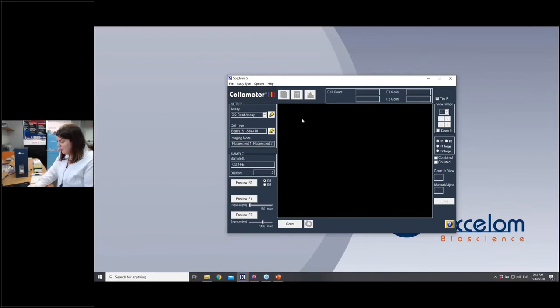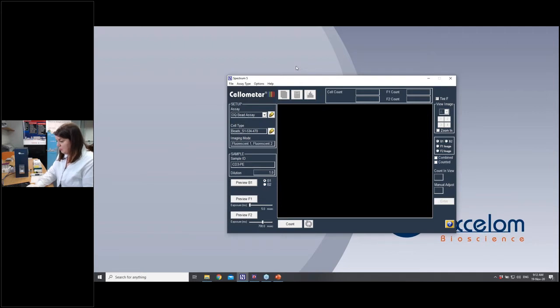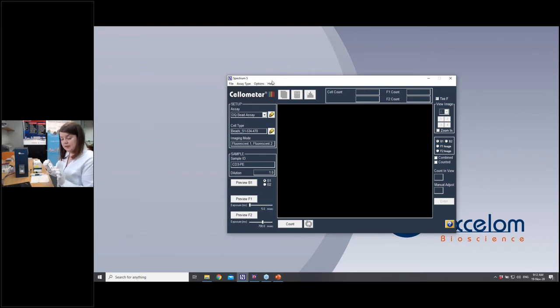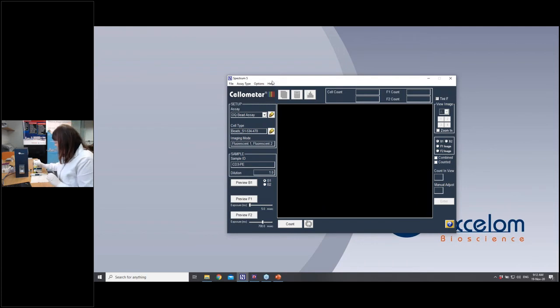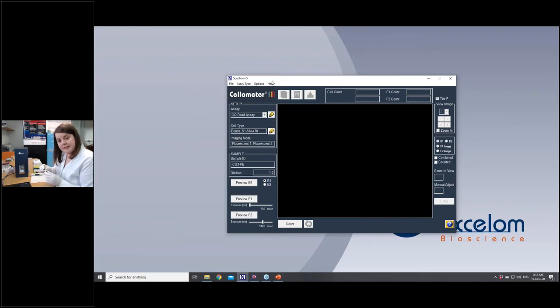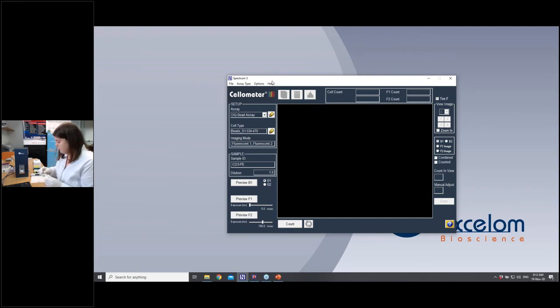Okay, so I hope you can now see my Spectrum software up here. I apologize if it's a little bit small. Hopefully you can see it well. I'll try and zoom in on some of the images so you can see those a bit more clearly. So this is the software and this is the Spectrum here. It comes with these disposable plastic slides. They're very easy to use. And what I'm going to demonstrate today is just some fluorescent beads that I have here. These are polystyrene beads. Some of them are green and some of them are red. So it's going to mimic a viability assay using AOPI, but just with the beads instead.